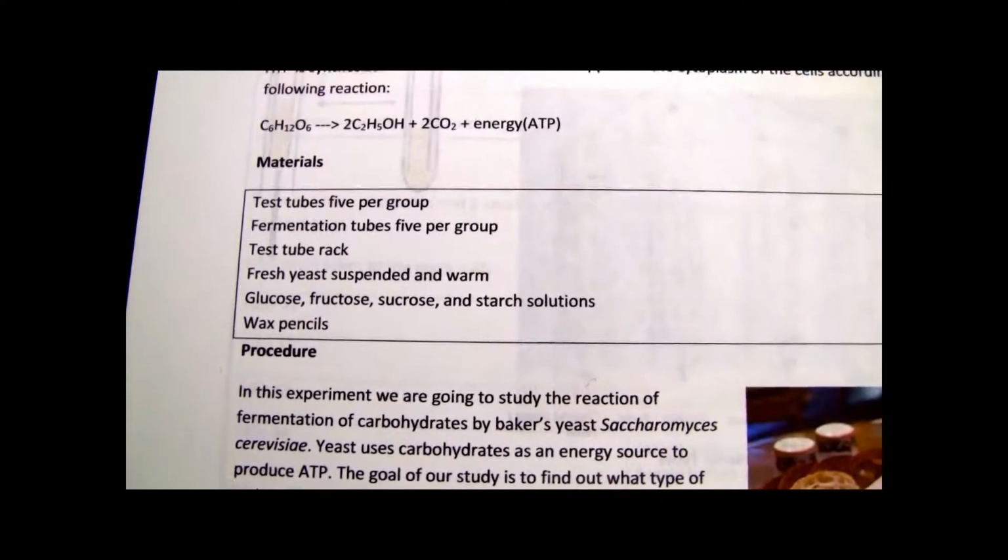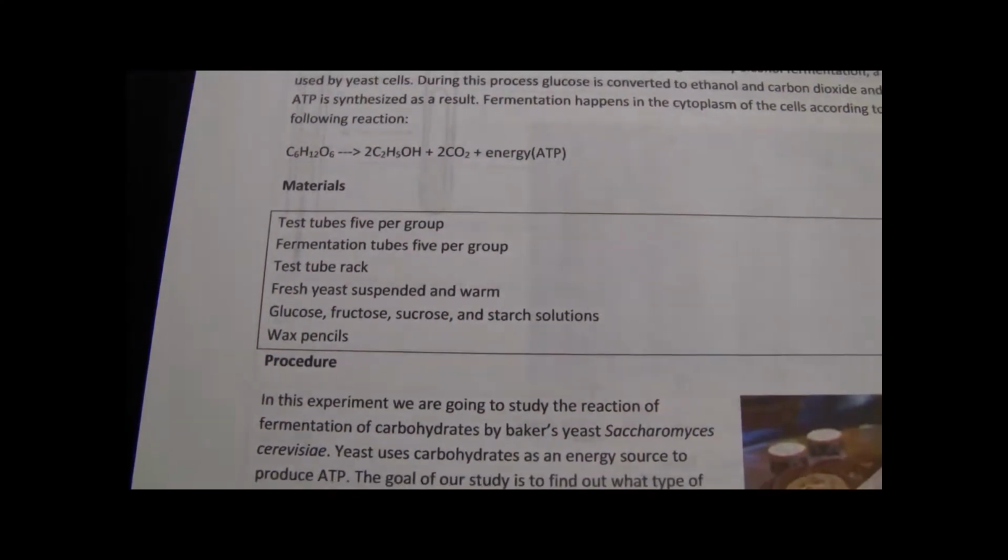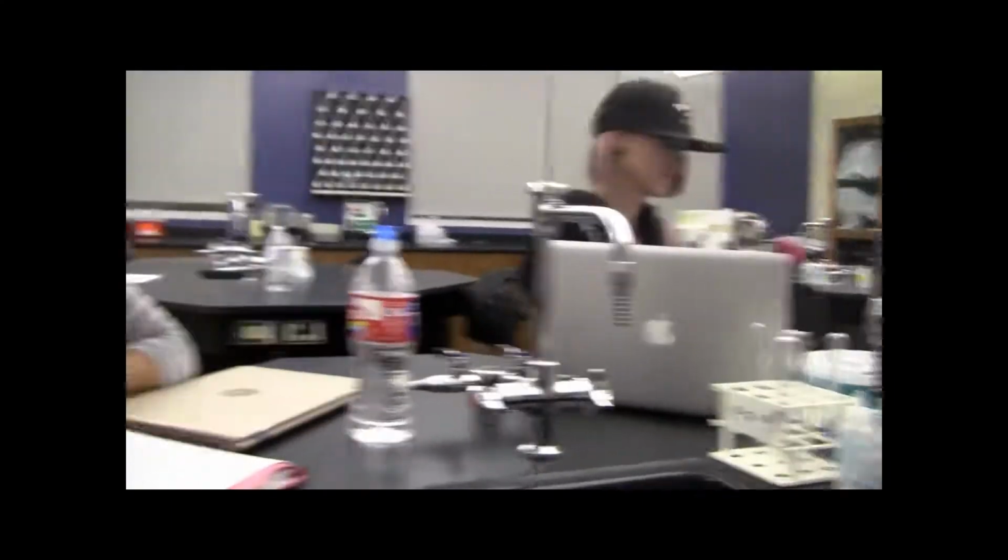First, we need the materials. What do we need? Test tubes, 5 per group. Who wants to do that? Okay, test tubes, 5 per group. Test tubes, right here.